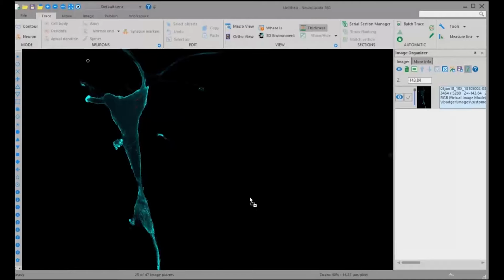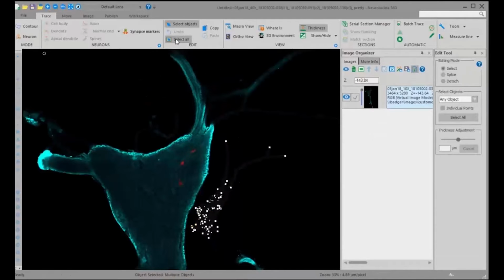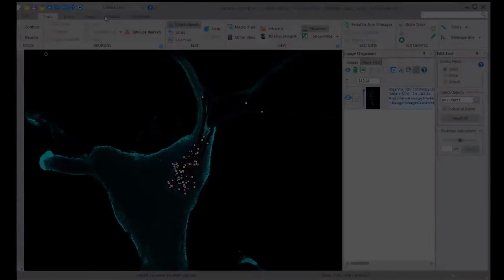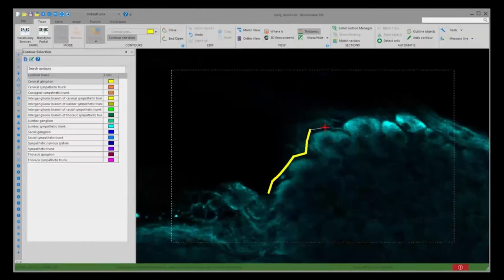Dr. Tompkins' lab also imaged the whole stellate ganglion in 3D at 10x magnification, and merged the backfilled cells reconstruction with the low resolution stellate image volume, moving the data in X, Y, and Z until it's aligned and registered to the lower resolution image. The registration process provides context with the larger structure of the stellate ganglion here.